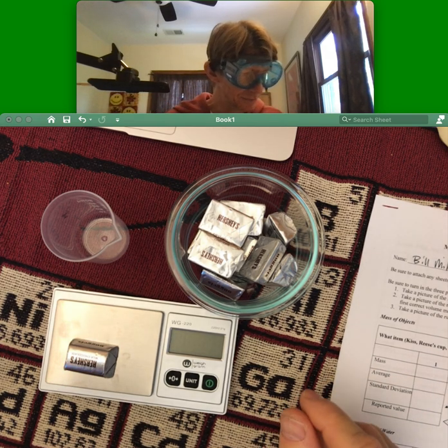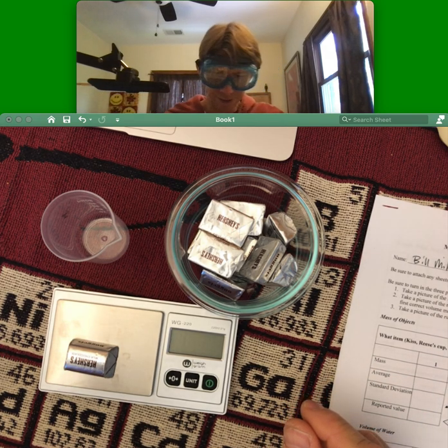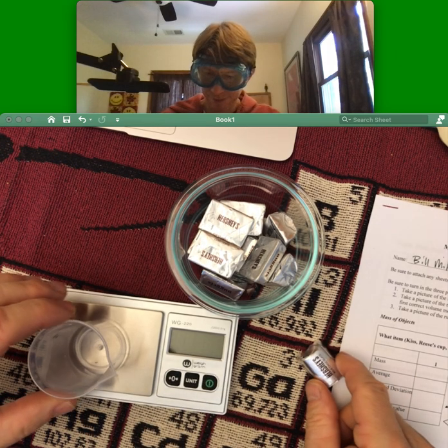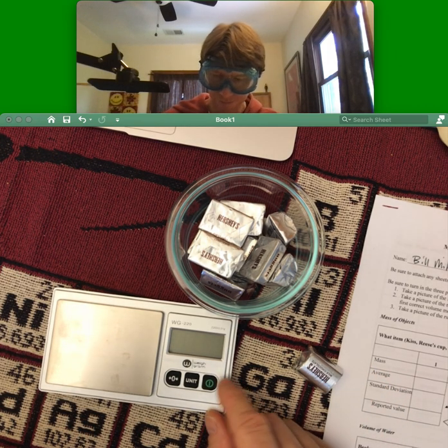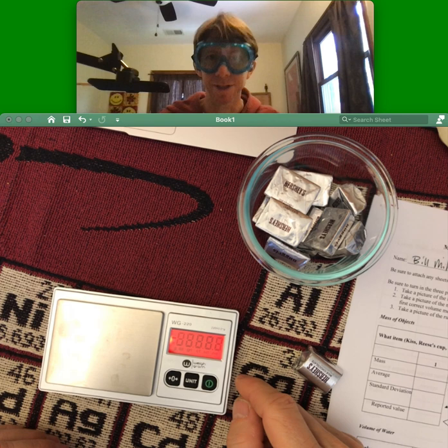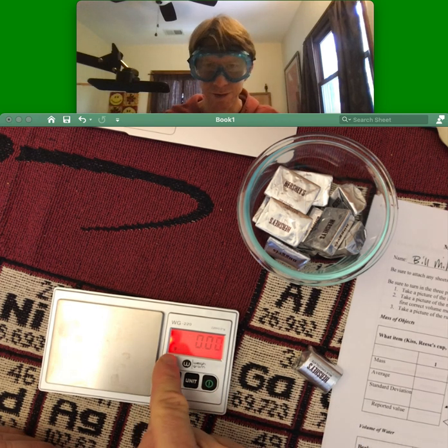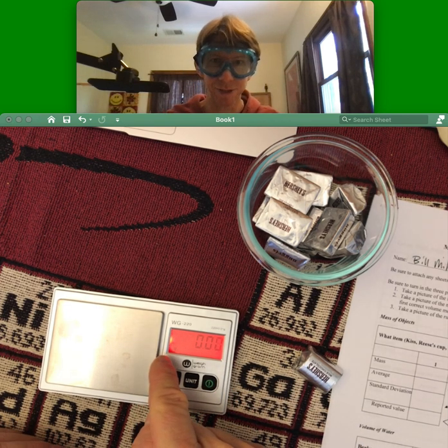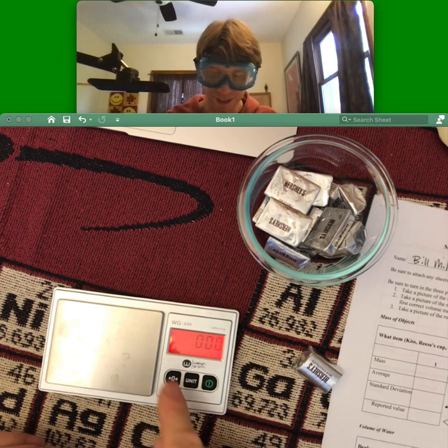All right, and it says place a clean, dry plastic beaker on the scale. Well, you can turn it on, you don't have to actually. But wait for that little circle to appear before you do any measurements ever or change anything. So it's at zero.